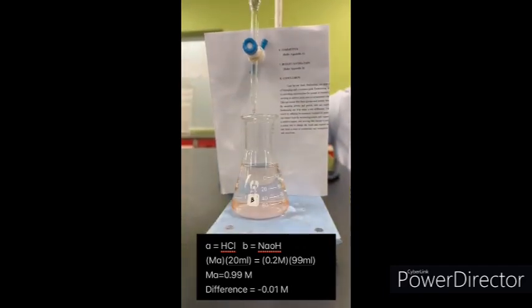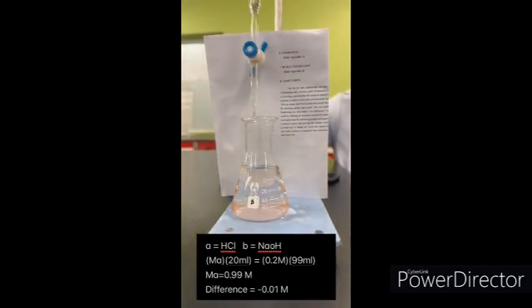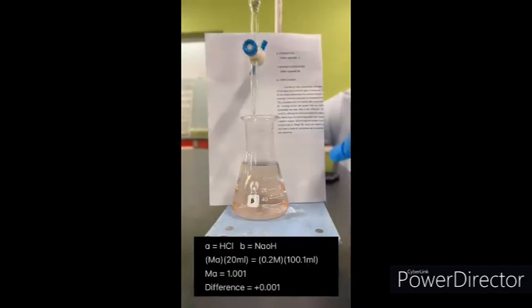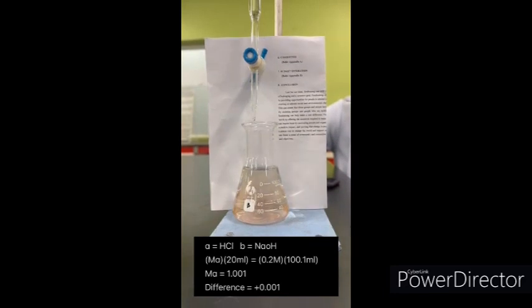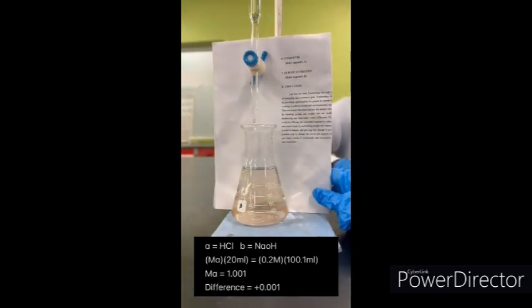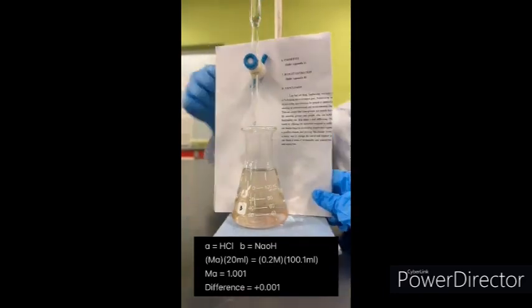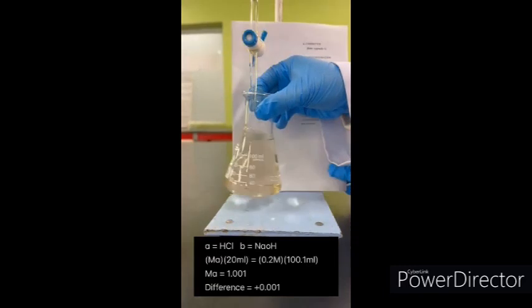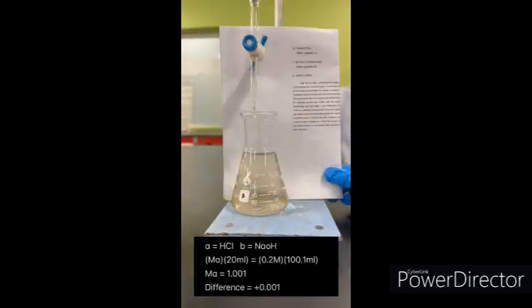So the onion extract is quite accurate in detecting the pH of solution. As for the second titration, we use 100.1 ml of sodium hydroxide. Using the same method of calculation, the molarity of hydrochloric acid calculated is 1.001 molar. Hence, it is only 0.001 molar more than the supposed result based on the theory.